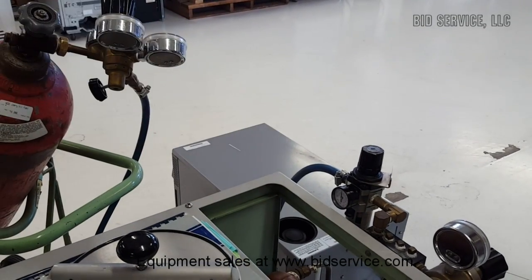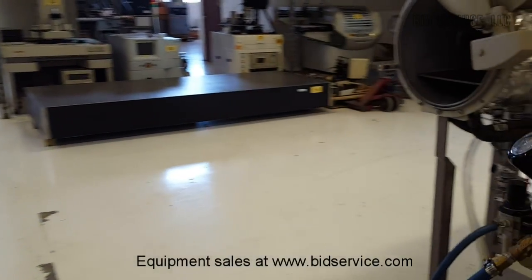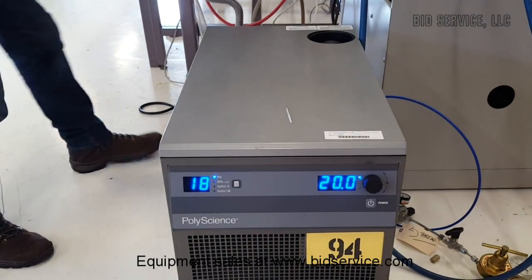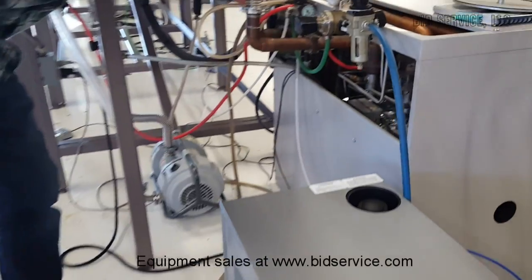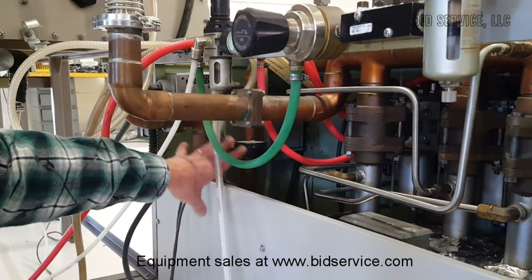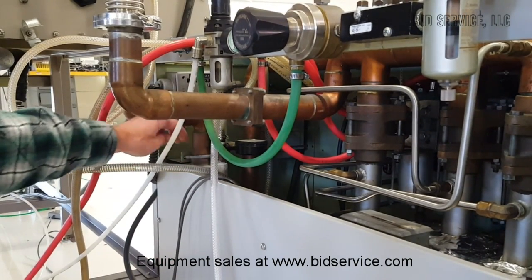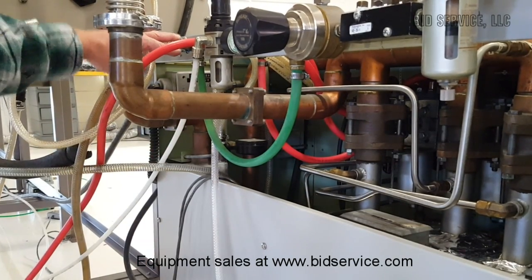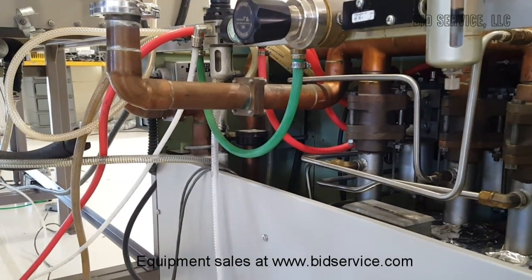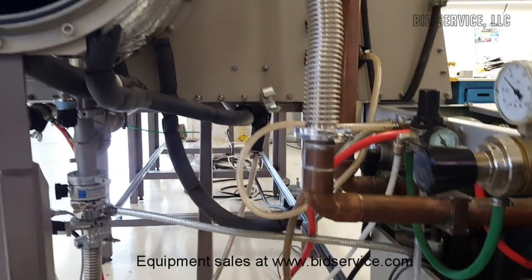We're going to need a chiller — you can see down here we have a water chiller. This is our house system; you'll have to provide your own. I run it at 20°C. The water goes to the heat transfer system here, which is part of the blower. The internal blower increases the heat of the inert gas slightly as it circulates, so it's cooled before going back into the box. We have the water going in and out of the heat transfer line right there.